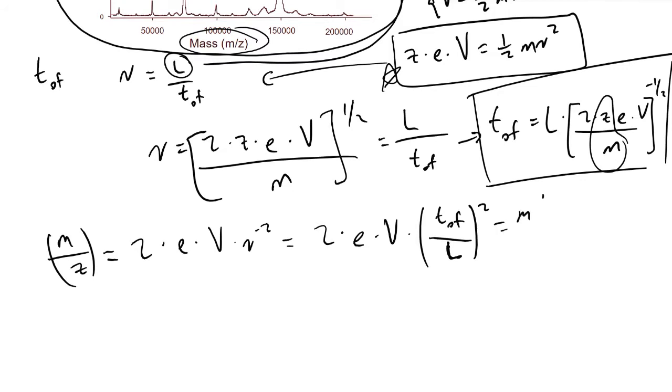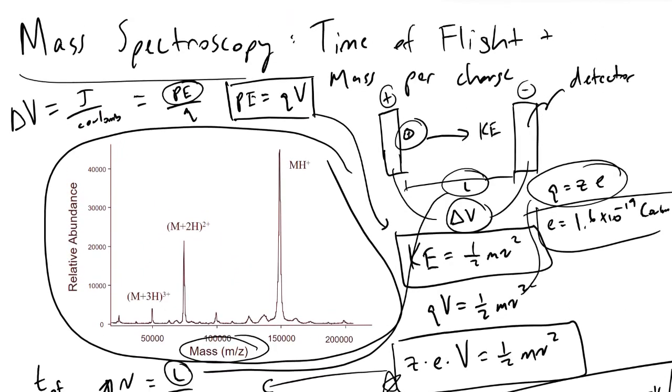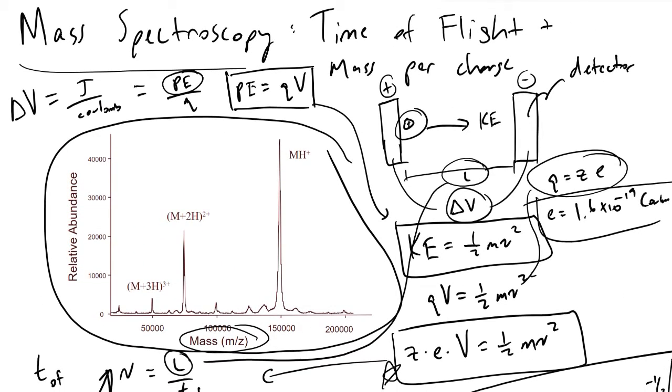We have just evaluated what the mass per charge is in our mass spectrometer, so we can generate plots like we see here. This concludes how we're able to get these important quantities to begin to examine these kinds of mass spectroscopy spectra.